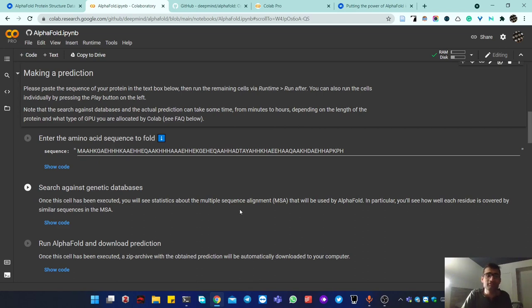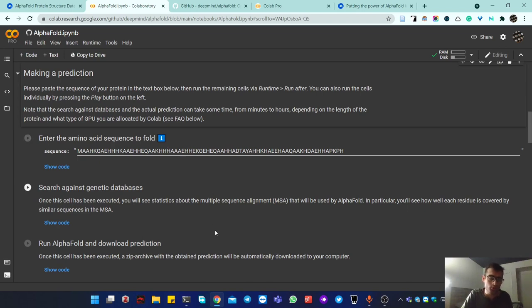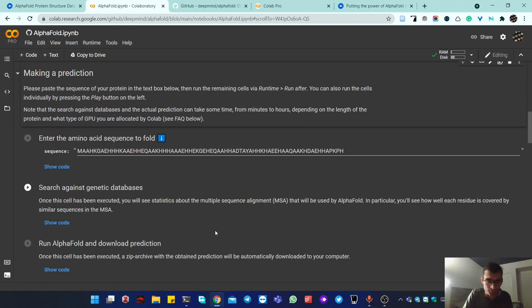However, if you have a fusion protein combining three proteins and the sequence is too long, even Colab Pro may not have enough RAM. In that case, the last option is to install AlphaFold on your own computer. If you're on Linux, you've probably already figured it out. If you're on Mac, since it's Unix-based and close to Linux, you should be able to install everything.